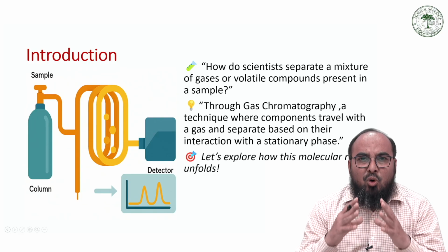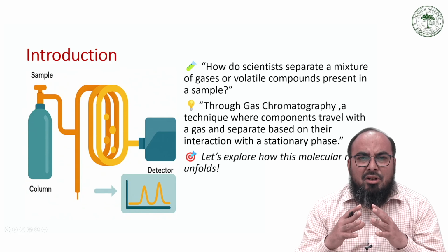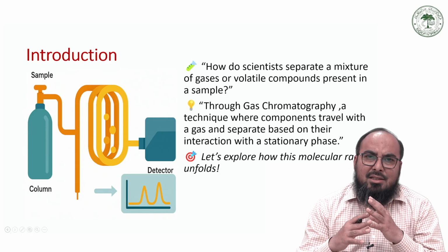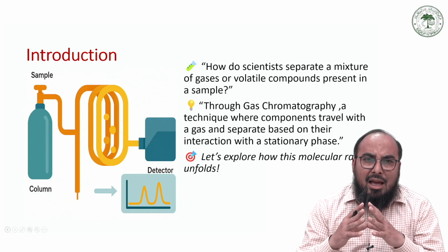So gas chromatography actually has three main components. One is the pressurized tank which contains the carrier gas.